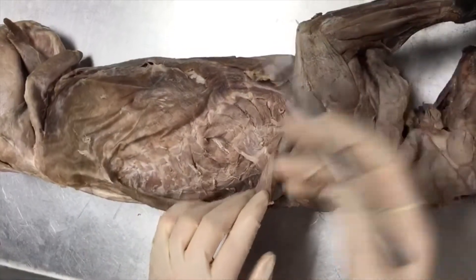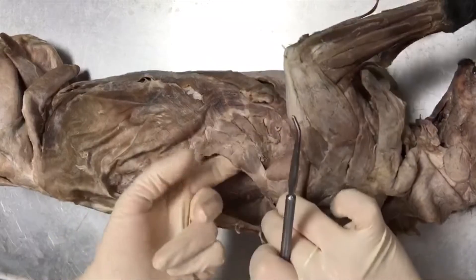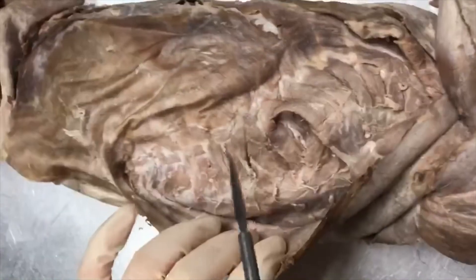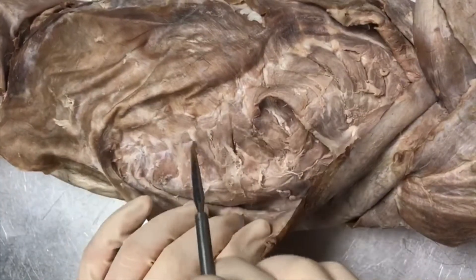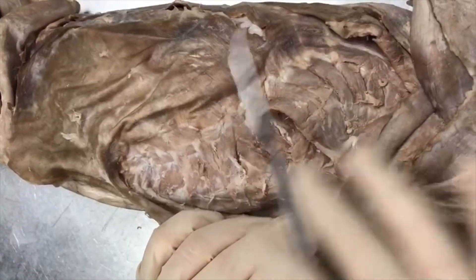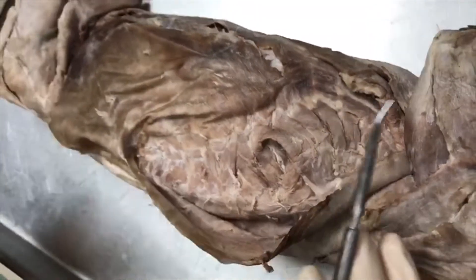Serratus ventralis was discussed in a previous video — it's going to be this grouping right here that you can lift up. Your serratus dorsalis are going to be these muscles over here, and you have two sections of it: the cranial, which is more towards the head, and the caudal, which is more towards the tail and the feet section.